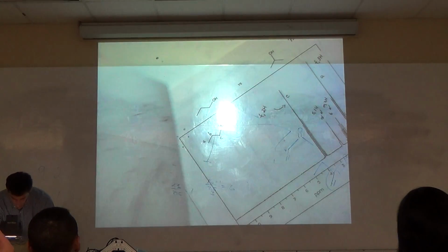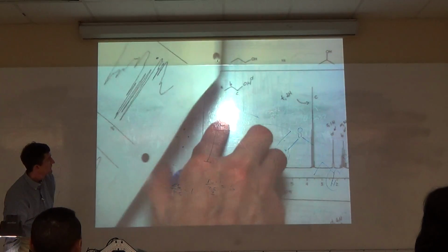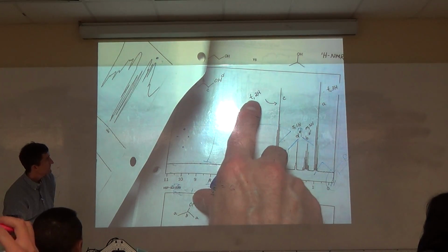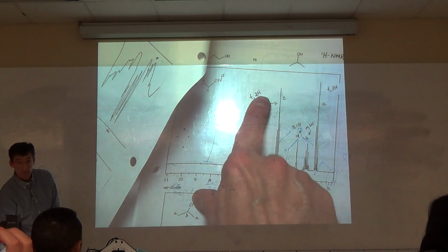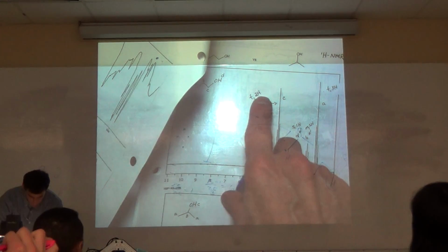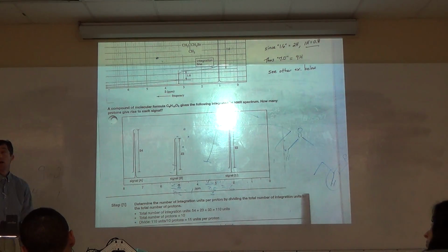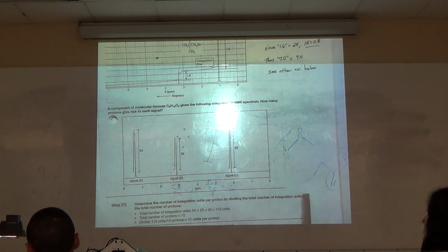Go back and look at the very beginning. I told you this was a triplet for 2 H's. I'm telling you it's 2 H's. But here's the thing. On standardized exams, such as the exam in this course, or maybe a DAT or an MCAT, they may throw you some integral lines that you have to work with.